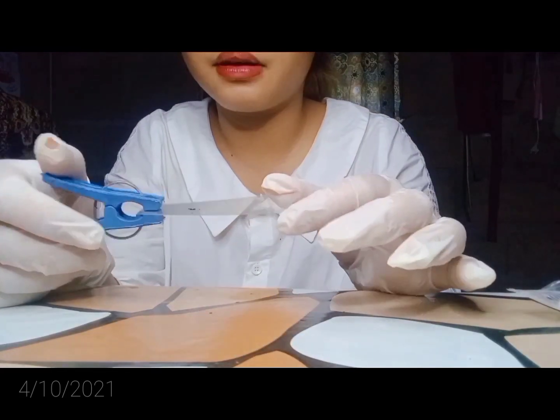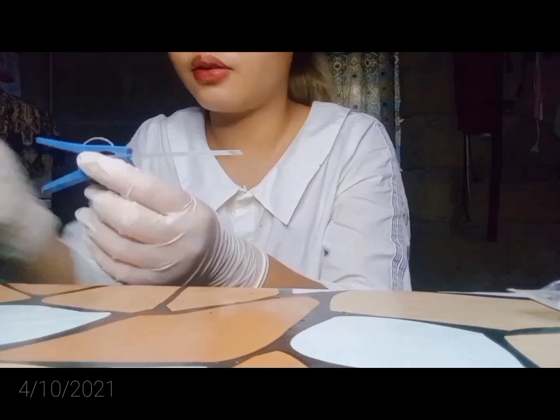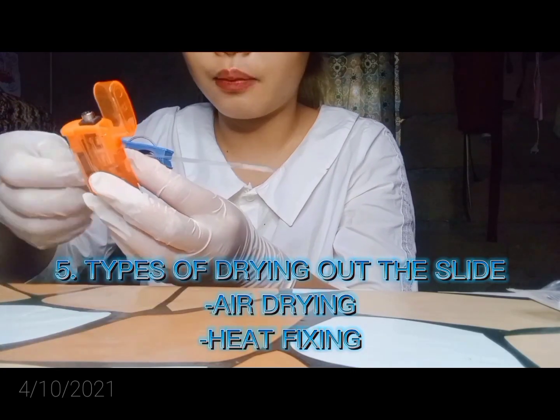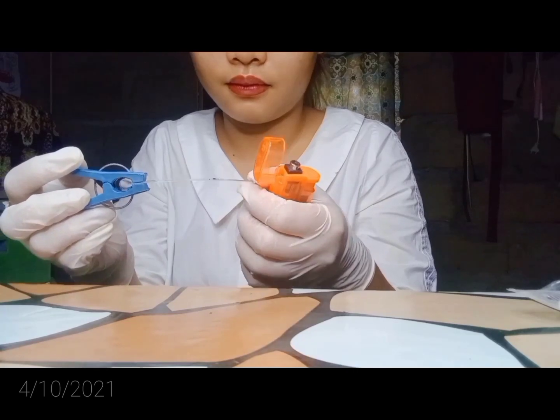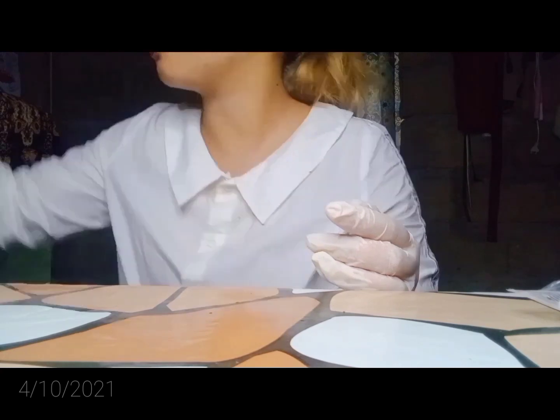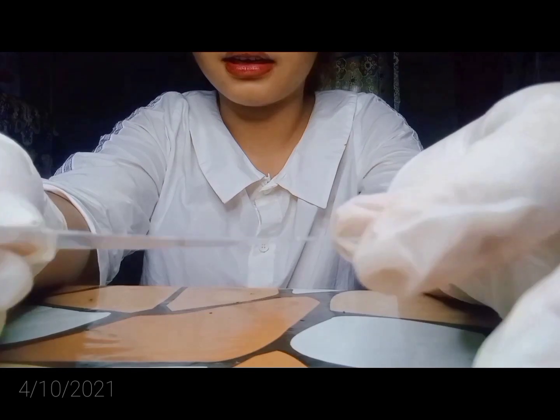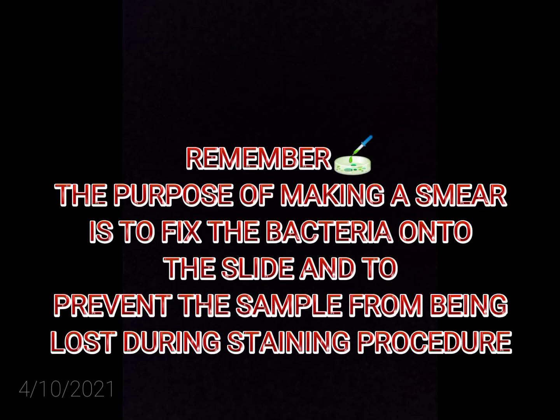To totally dry out our specimen, we are going to do air drying or heating. If we are going to do air drying, it takes much more time, but if we are going to use fire, heat up our slide until the sample is already dry. Remember that the purpose of making a smear is to fix the bacteria onto the slide and to prevent the sample from being lost during the staining procedure.